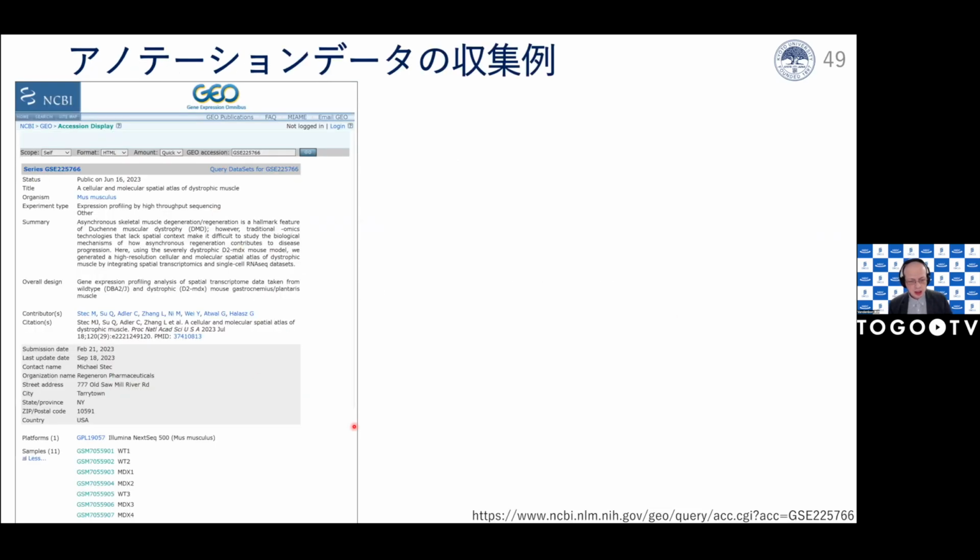And as I said, we did the annotation. We really try to do this manually as far as possible. For example, if the sample was collected from GEO, we will go to the series that produced that sample and check the species, of course. Then it says dystrophic muscle, so I guess it's a muscle tissue. And it says severely dystrophic D2-MDX mouse model, so we will write that down also.